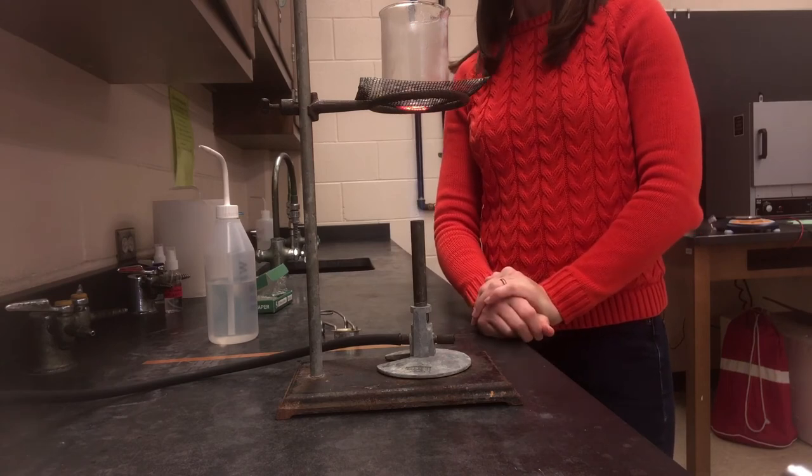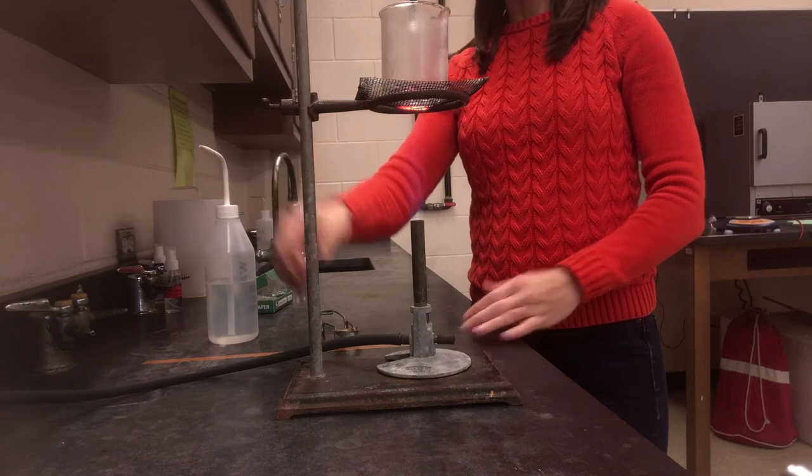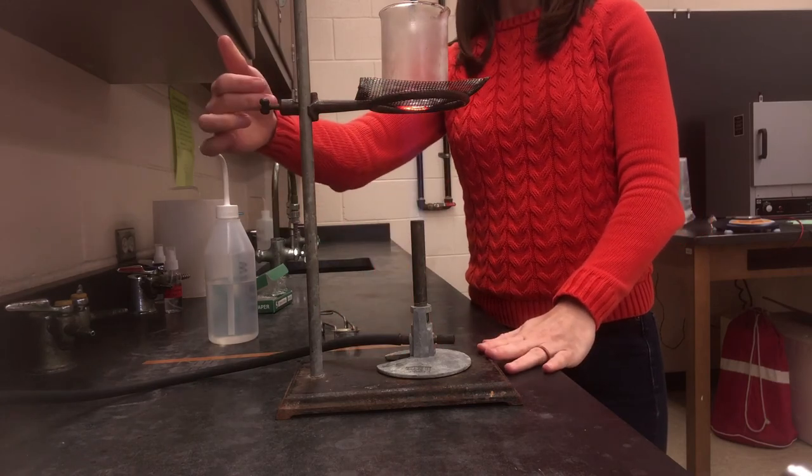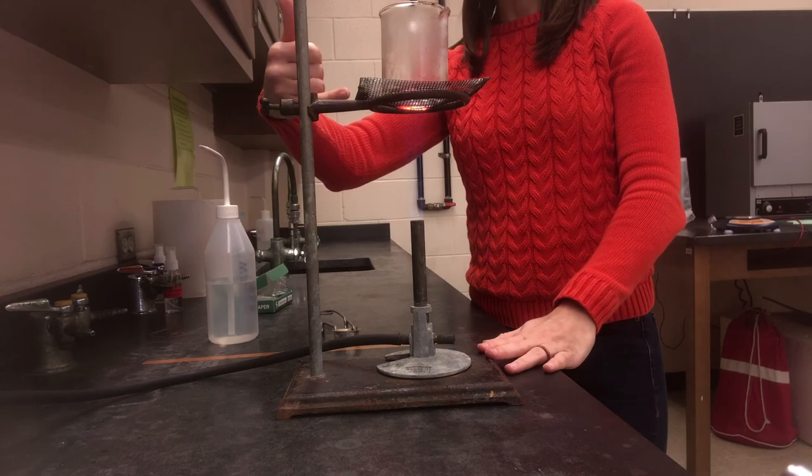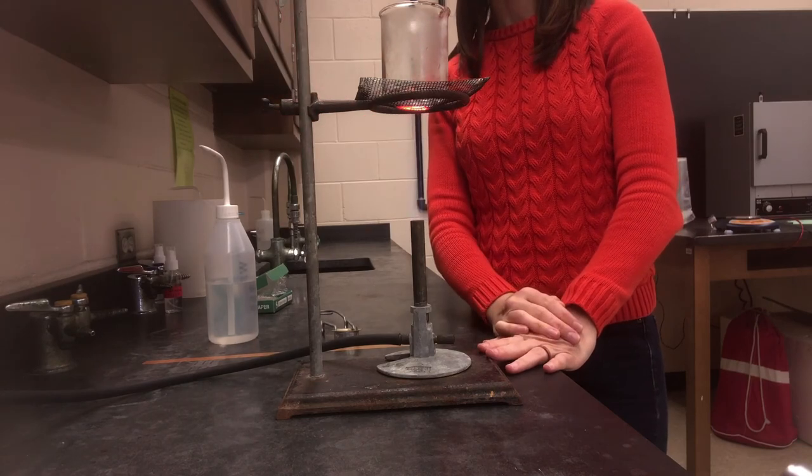So the idea is you've got a ring stand that your Bunsen burner sits on top, an iron ring, and then a piece of wire mesh or wire screening to support whatever object it is that you're going to be heating.